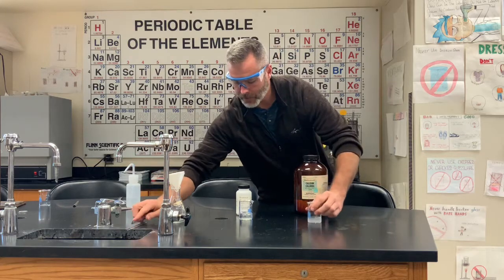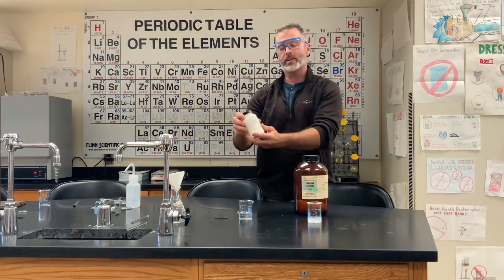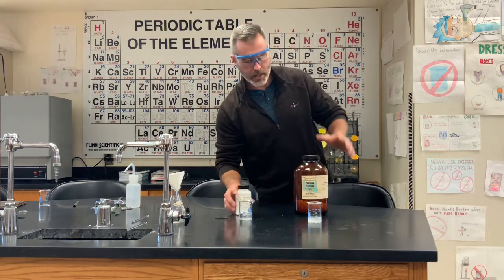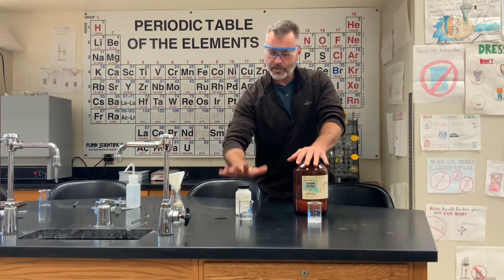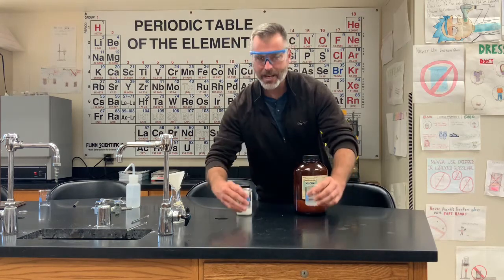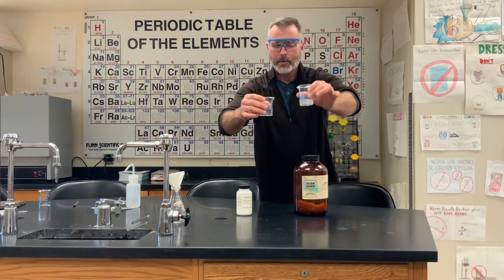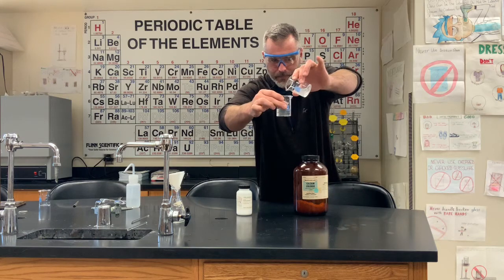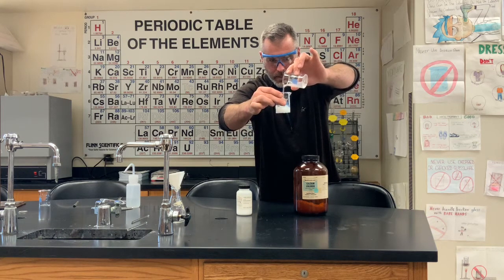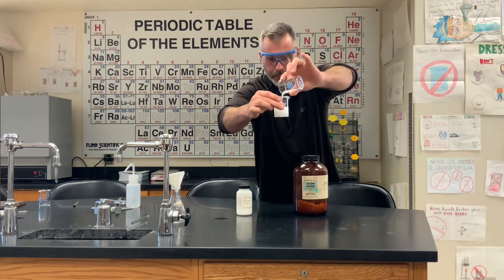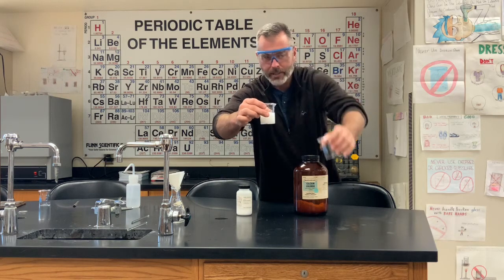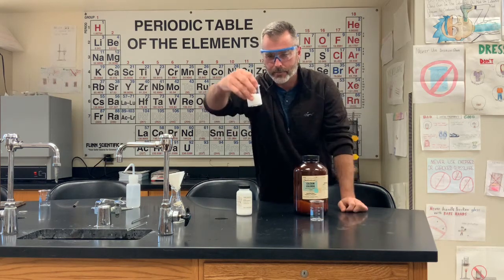Take the stirring rod out. In this one, we have sodium carbonate. So we're going to mix calcium chloride with sodium carbonate, and we should see a reaction. As you can see, this one's beautifully clear. This one is a little bit cloudy. When I pour them together, this is how skim milk is made. Totally kidding. It's not. Skim milk is the skinny cows.